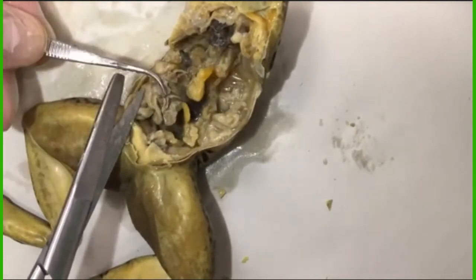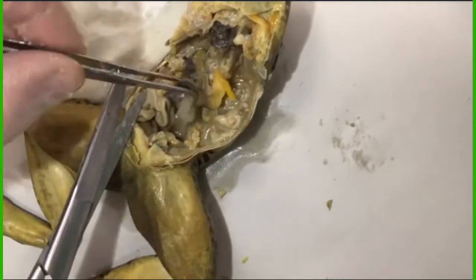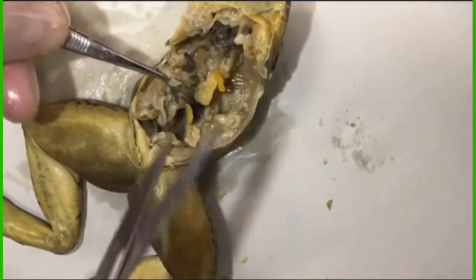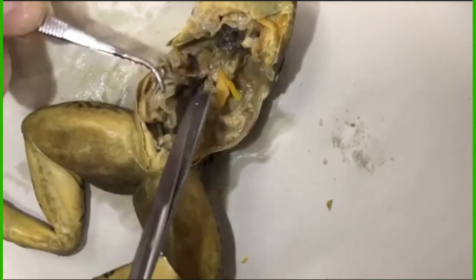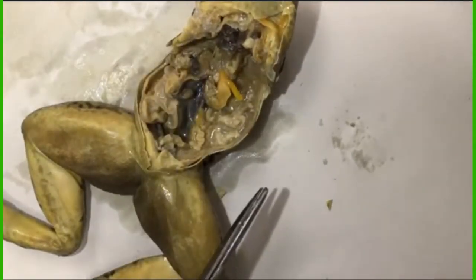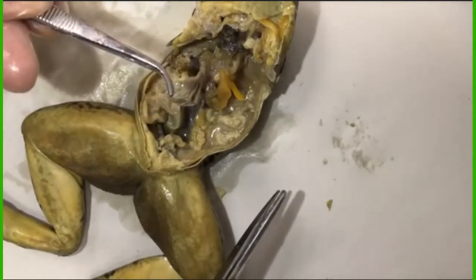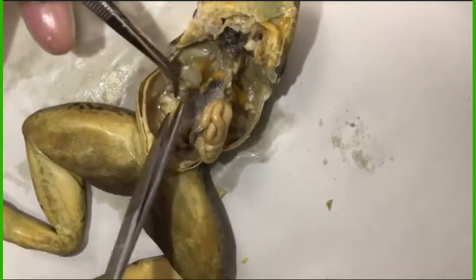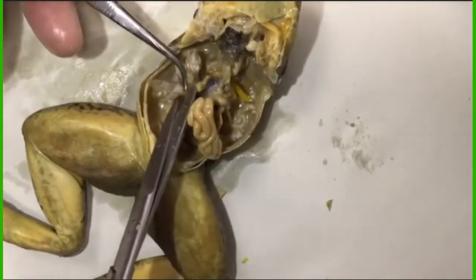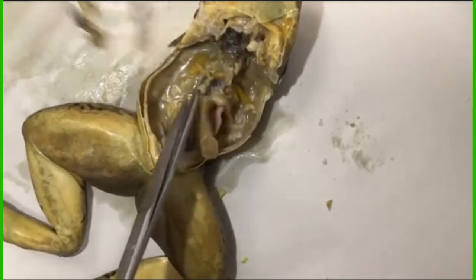That's one ovary right there. So yes, it is a female. Okay, I'm going to snip that one ovary out. There it is right there. And it was coming into condition. Many times when the females are way out of breeding condition, they're going to look way smaller than that. These are getting close to where they're going to be producing eggs, fairly large, pretty easy to identify.